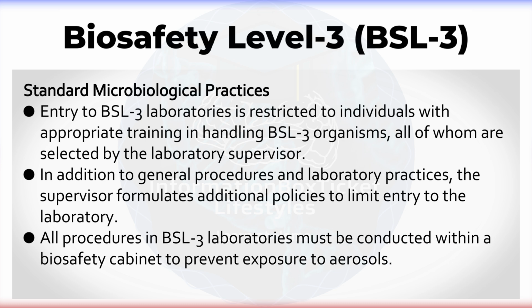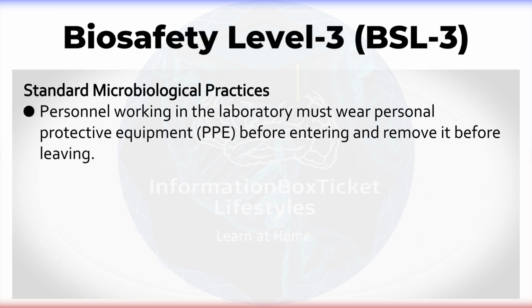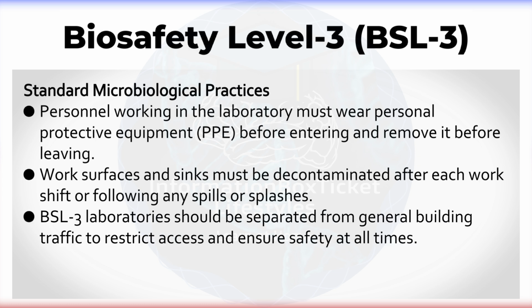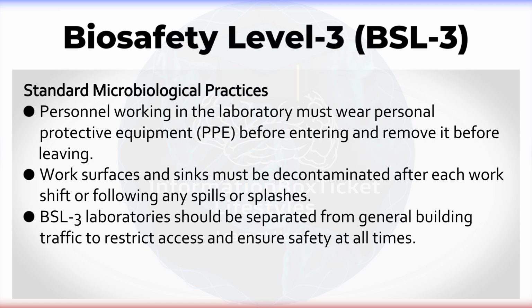All procedures in BSL-3 laboratories must be conducted within a biosafety cabinet to prevent exposure to aerosols. Personnel working in the laboratory must wear personal protective equipment, PPE, before entering and remove it before leaving. Work surfaces and sinks must be decontaminated after each work shift or following any spills or splashes. BSL-3 laboratories should be separated from general building traffic to restrict access and ensure safety at all times.